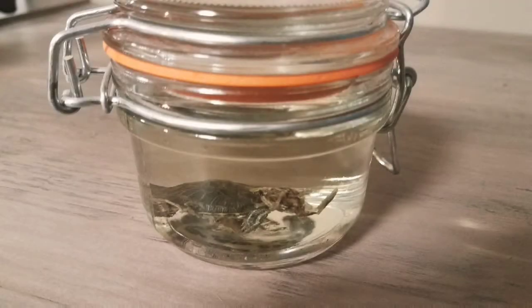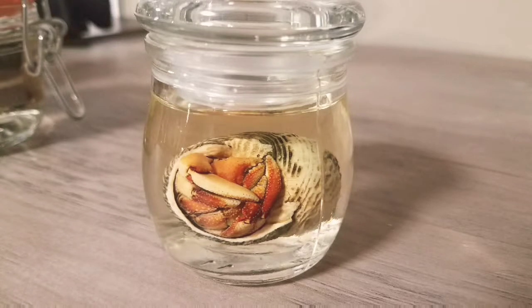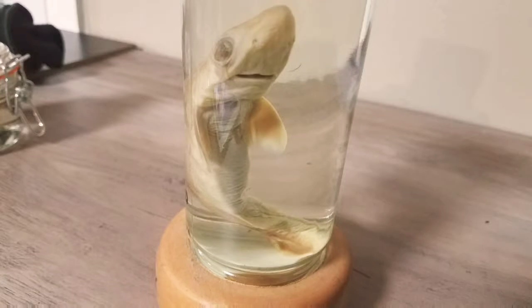Hello everybody, it's Chad from Explore, Collect, and Grow. Today I'm doing a simple tutorial on how to make a wet specimen. A wet specimen is a way of preserving a small dead animal in a jar.